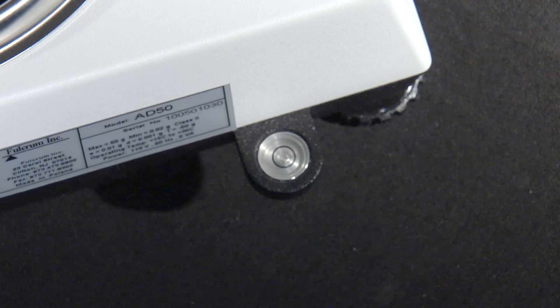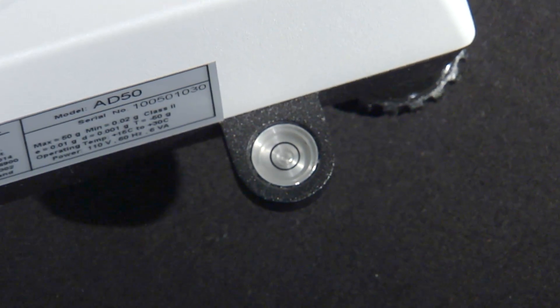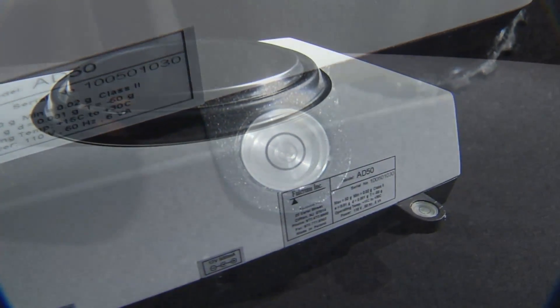Combined with an accurate bubble level indicator, the system ensures fast, accurate and easy leveling.